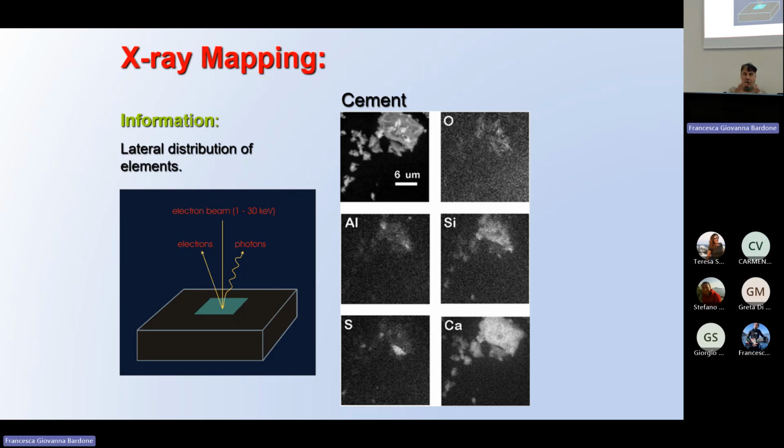So in the development of instruments, we thought about something in which you don't have anything to prepare on your sample. You can take whatever type of sample you put inside. No modification. But the usual type of SEM is this one.